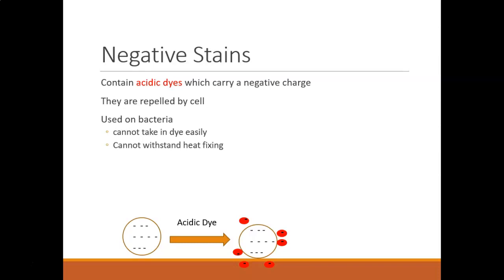They do not take in stain very effectively because they have a material in their cell wall called mycolic acid. And mycolic acid keeps certain stains from being able to be retained as effectively. They still will retain them, but not as easily as other cells.